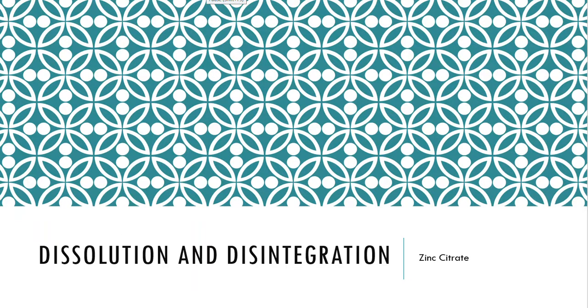Okay, CTC 145, welcome to the lecture on dissolution and disintegration. You're probably watching this lecture video wondering what dissolution and disintegration is, and that's the purpose of what we're getting ready to do. So we're going to break it down. We're going to label this as part A for dissolution, and this as part B for disintegration, and you're going to be doing both of these in the lab experiment. All right, so without wasting any more of your time, let's have a chat.